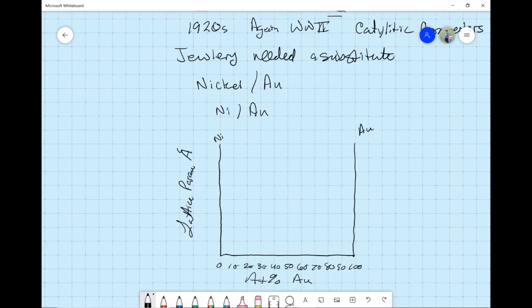And it's going to be in angstroms, okay? And A, lattice parameter A. And so nickel, the lattice parameter of nickel is... and the lattice parameter of gold is 4.08. So let's just say this was 3, this is 3.5, and this is roughly 4. And so we can put it slightly higher. I'm trying to be somewhat approximate using my fake graph paper here.